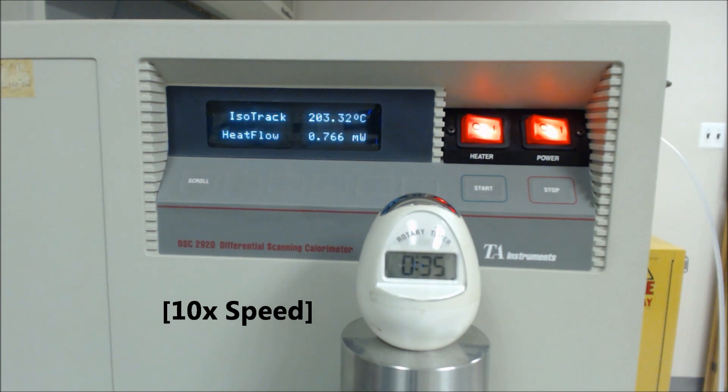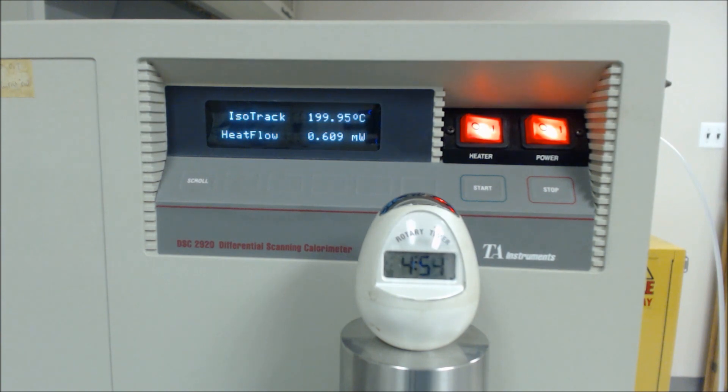As we wait the 5 minutes for the DSC cell to complete its first isotrack phase, we prepare for arguably the most important part of the test, marking the T sub 0, or the starting point for the OIT calculation. At this T sub 0, two things must happen simultaneously. The time since the beginning of the test must be recorded, typically right off the computer software, and the gas in the chamber must be switched from nitrogen to oxygen. Depending on your hardware and software configuration, these tasks may either be automated or must be completed manually.